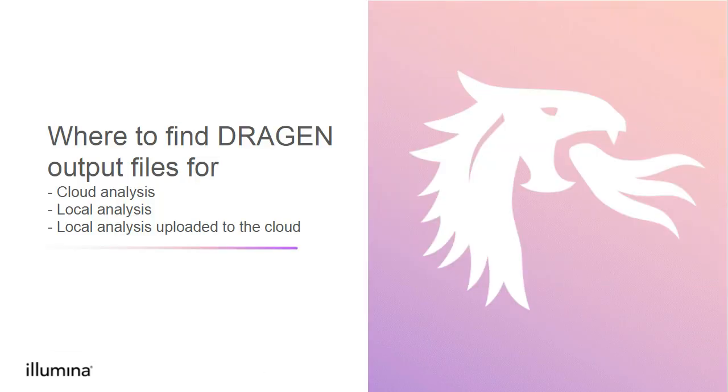Now we are moving on to the second half, where we will discuss what to expect once the NextSeq 2K DRAGEN analysis completes. Let's start with the location of the DRAGEN output files post-analysis.